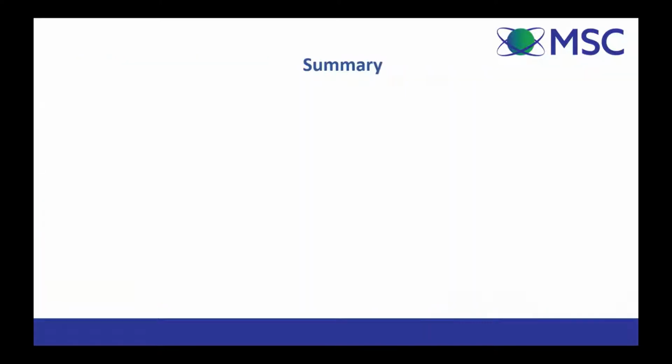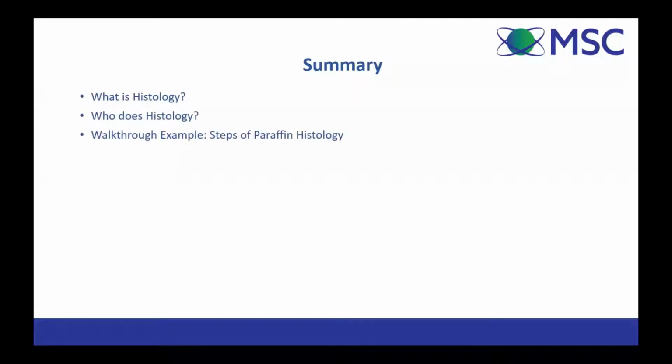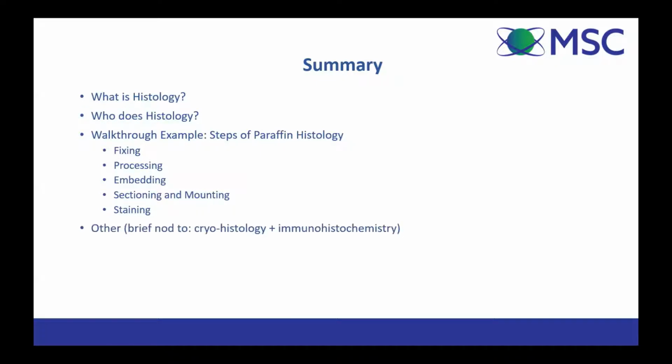So I'm just going to summarize what I'm going to go through today, and you can feel free to ask any questions at any point. I'm going to go through what is histology and who does histology. I'm going to do a walkthrough example of paraffin histology because it's one of the more commonly used kinds of histology. This involves everything from fixing your samples to processing them, embedding them, sectioning them, mounting them, and then staining them.